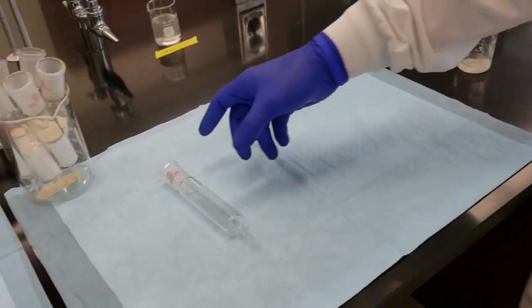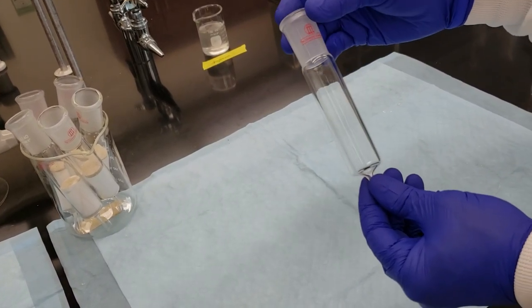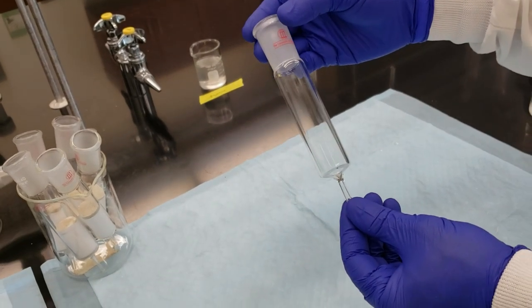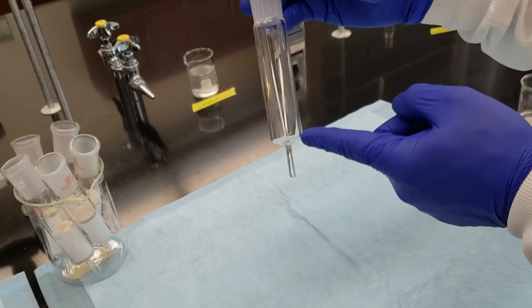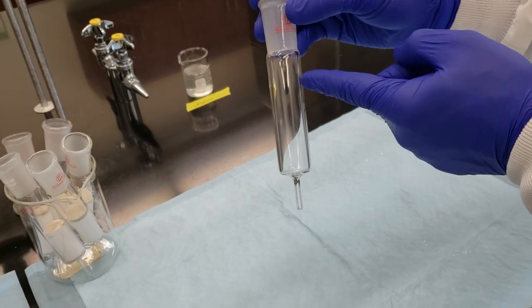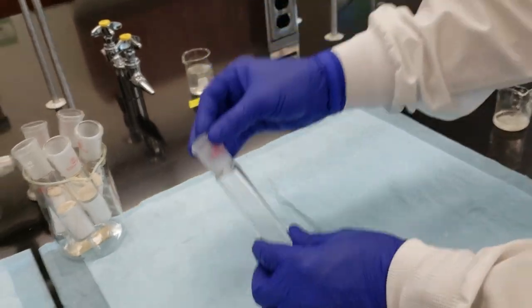The next stage of our reaction is continued purification. We're going to be using a flash chromatography setup. This is an empty column. This is what it looks like before we set it up for our flash chromatography. What we do is we put a small plug of cotton in the bottom, a layer of sand, a plug of silica gel in the center, a couple of inches high. I'll show you one in just a second that's been filled, and then a final finishing layer of sand on top to keep everything level.